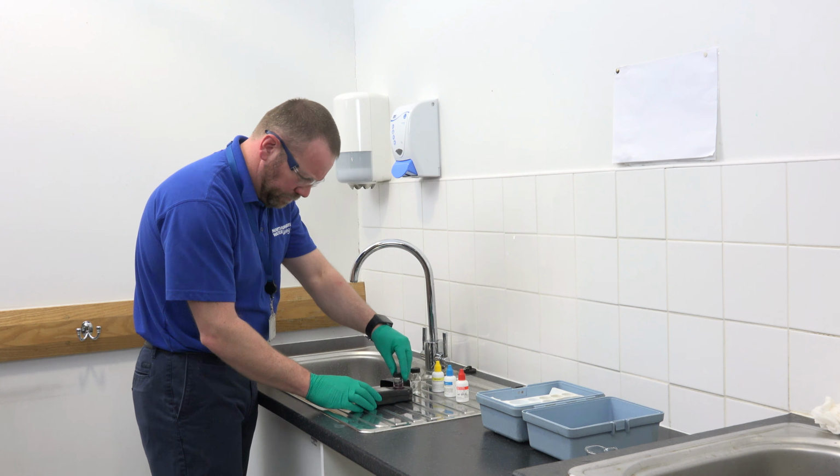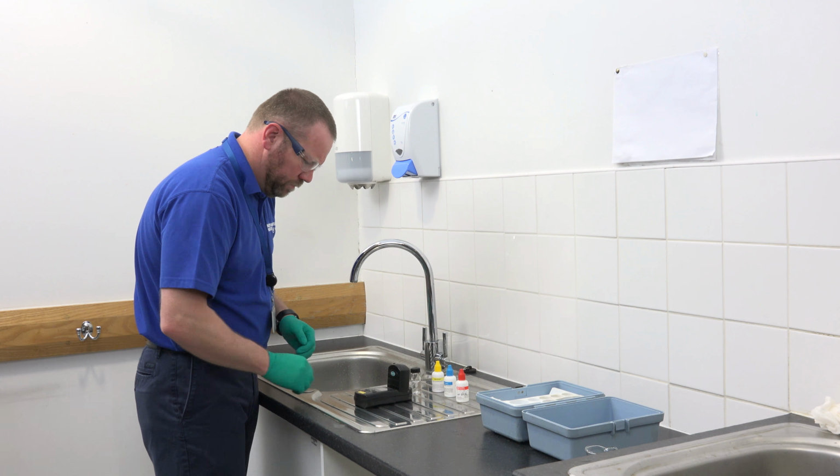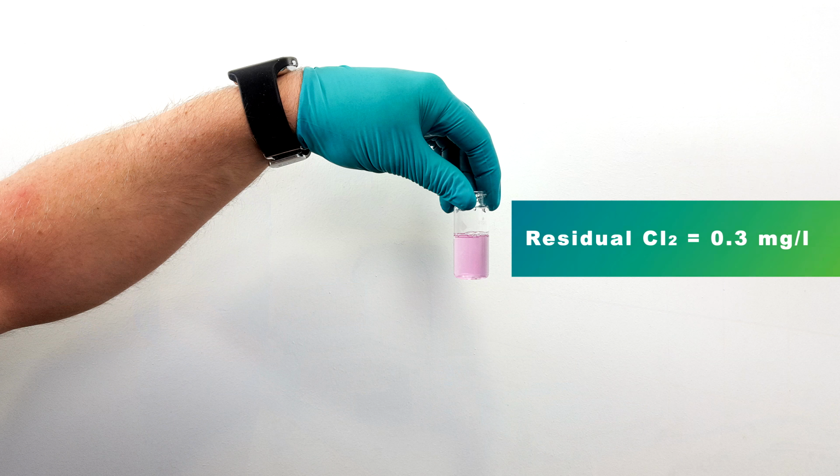If we didn't do this, then we wouldn't know if chlorine levels were artificially elevated by our tap disinfection chemicals when we took the sample. In this example, the baseline residual chlorine level has been measured at 0.3 milligrams per litre.